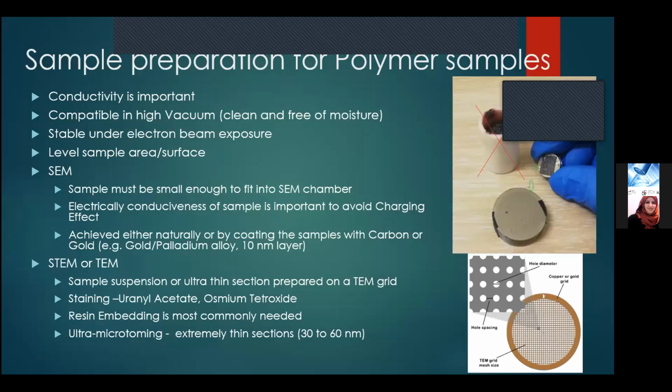Then for SEM sample preparation, it's usually very, very simple. As you can see in the picture on the right, I've indicated some methods for sample preparation. The large mount you see on the bottom, I think I can show you here. This is usually for geological samples, but sometimes for powders that you need quantifiable data for. This is also a very good way of embedding your sample in resin and then polishing it and making sure that the area is level, so that you have the best opportunity to access your sample.